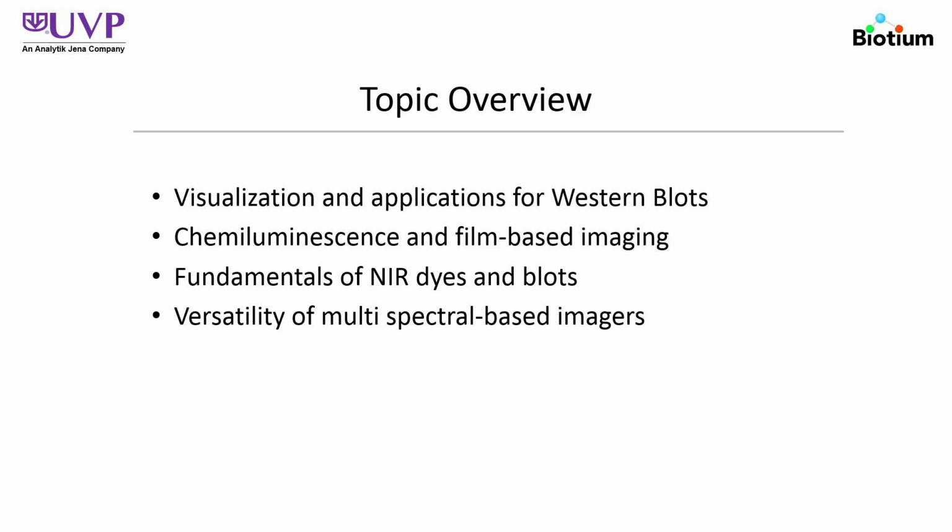Digital CCD imaging is more sensitive and gives a researcher a wider range of accurate data, and that will also be covered in detail. Dr. Roberts will be talking in detail also about fluorescent blotting in the NIR later in the presentation. Lastly, we will have a discussion on the feature sets for CCD-based imagers that are best suited for chemiluminescent and NIR protein blotting.